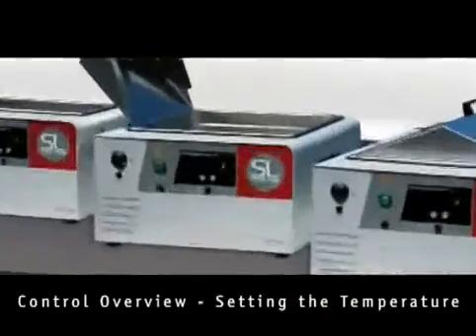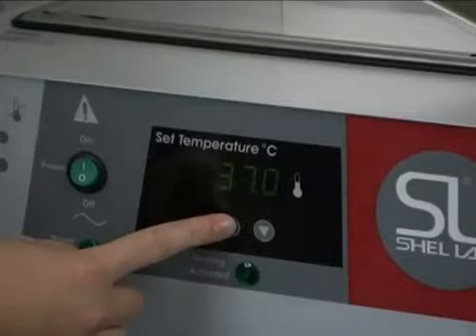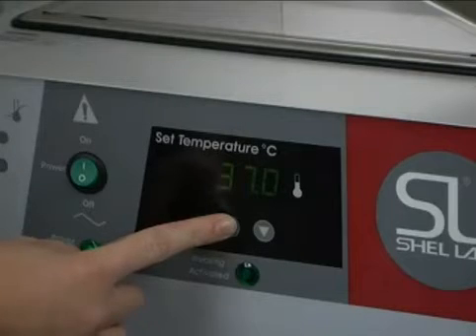To set the temperature of your Shell Lab bath, press the up or down arrow once. You will see SP flash on the display, indicating that you can change the set point.